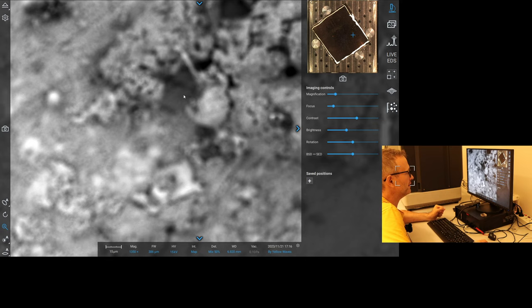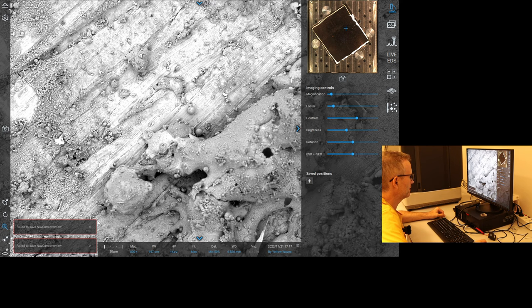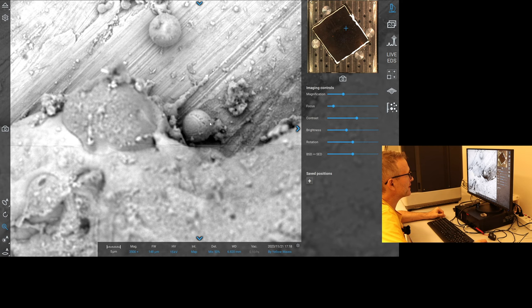So what we are looking at here is the outside of the inside sphere on the Malcolm Bendel 8-year-old Perkins attached large thunderstorm generator. And this sample here, we can see it really does look like it might have our usual suspect spheres. Maybe this is a silicon sphere and this is an iron-rich crenellated sphere. And we are going to have a look.